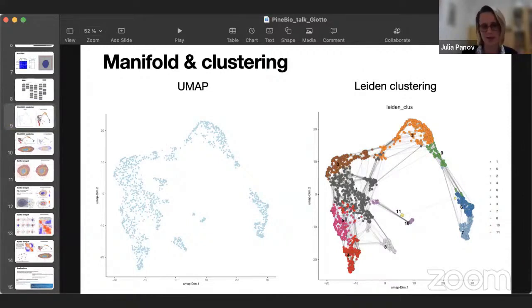So also with such complicated data as single cell or spatial single cell, if you look at all the articles, you will see that most of the people use UMAP or TSNE, but there are many, many more embedding methods available, and we recommend to really look through at least a few, because some of them are based on different things, and they also will reveal different underlying structures of the data. So I hope that helps.